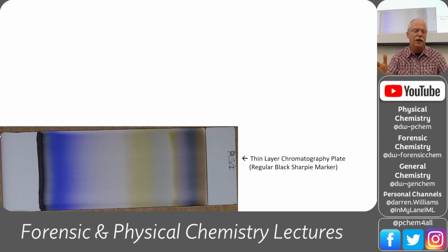Like if I've got an ultrasonic tank and I want to see if it's really operating, they can still make noise and not actually be doing anything. And so there could be an electronic noise coming out of that thing, but it's not actually making cavitation under the water. So you can use the Sharpie test and a foil erosion test, all these different kinds of tests to see if the ultrasonic energy is really there.